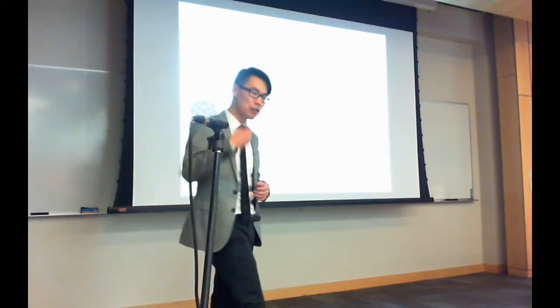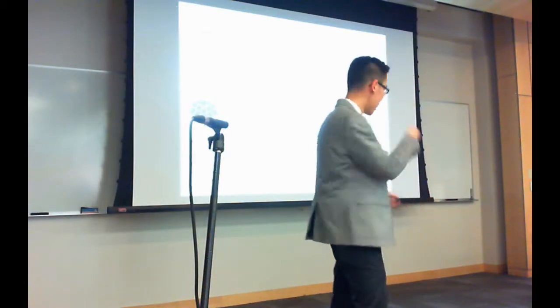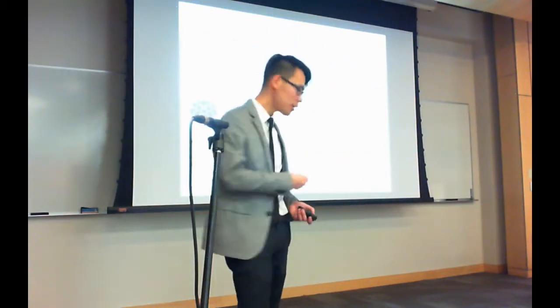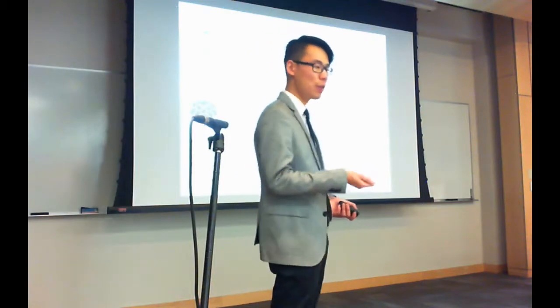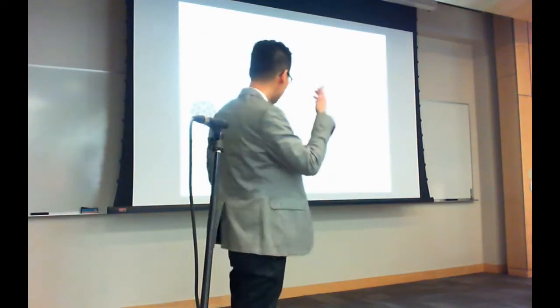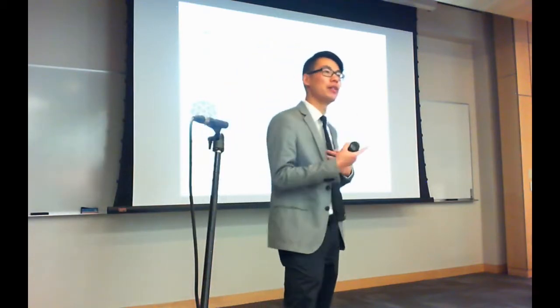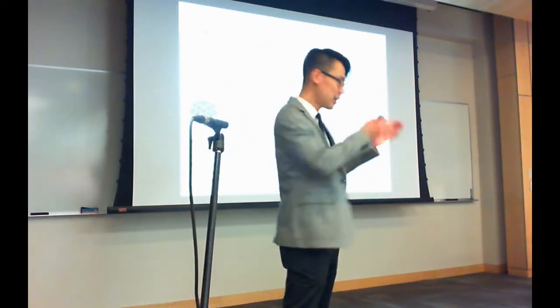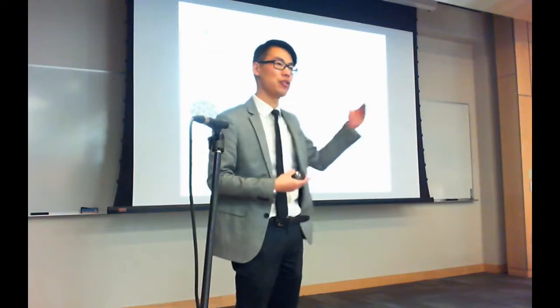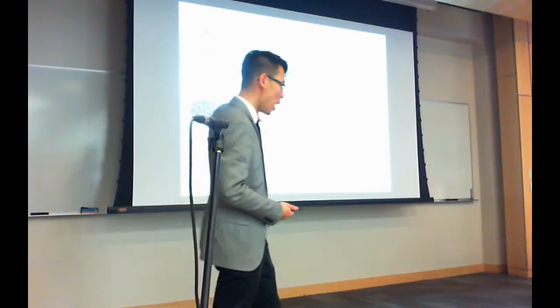Beyond that, to do proper reanalysis of data on this scale, we need a lot of compute. We're talking about hundreds of CPU years of compute, which is out of the reach of most laboratories out there. We need robust analysis workflows. We need things that can analyze data on this scale, that don't eat up RAM, that is high throughput, and that can tolerate failure. And we also need to be able to track provenance. Whenever we analyze something, we must be able to go back to the original data, to the original job, the original parameters. And we also need to visualize what we're actually observing. And so all these things together help to make Massive what it is.